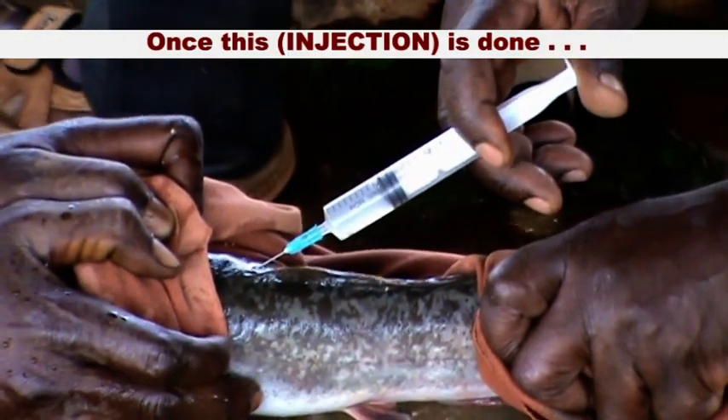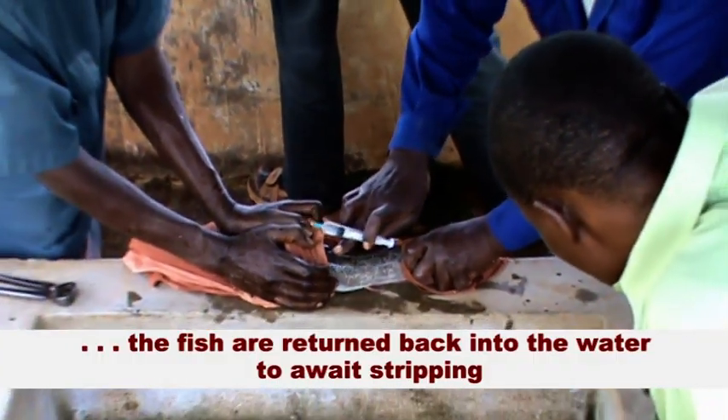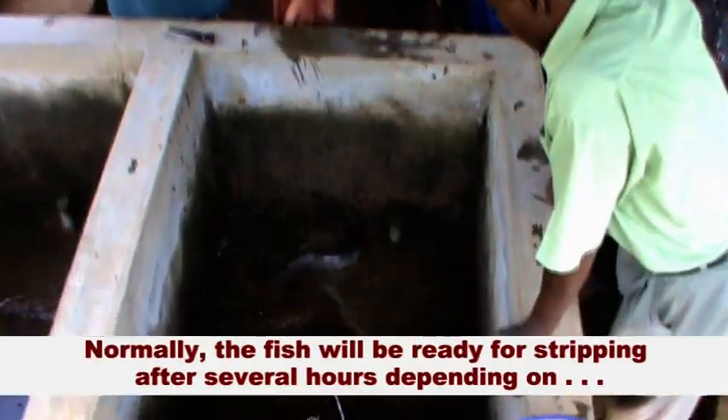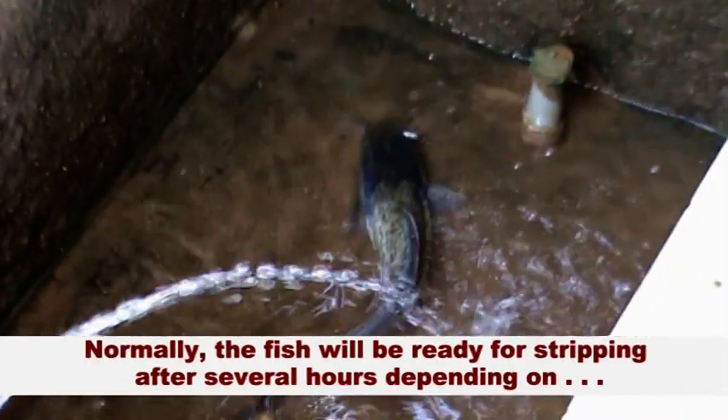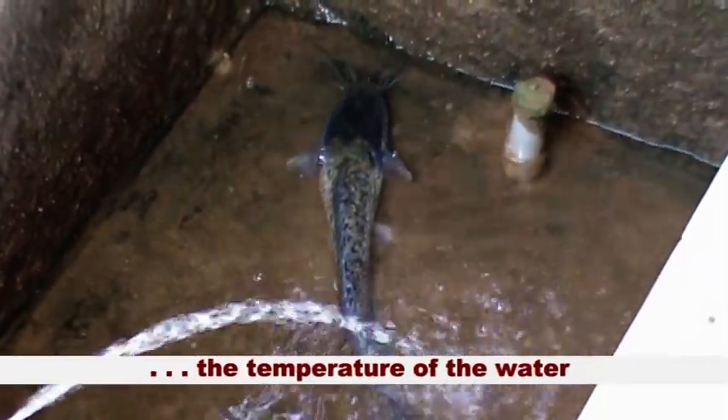Once this is done, the fish are turned back into the tanks to await stripping. Normally, the fish will be ready for stripping after several hours depending on the temperature of the water.